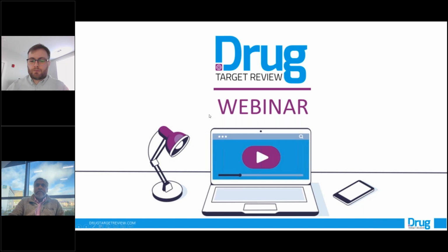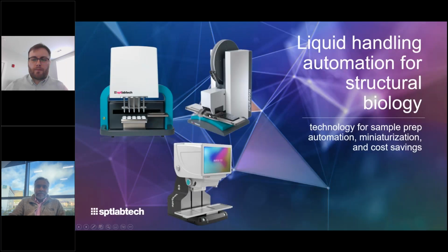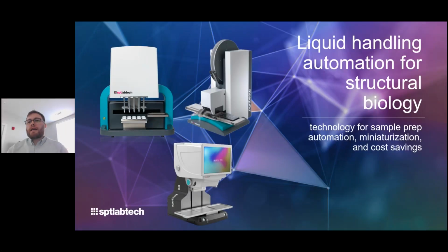Thank you. For today's presentation, I'm going to be discussing SPT's liquid handling instrumentation and how they can assist your automation for structural biology, particularly crystallography. First, I'll discuss a workflow for crystallography with these instruments. Then I will introduce each instrument in turn. And then eventually I will pass on to my collaborator Susmith, who will discuss his use of these instruments.